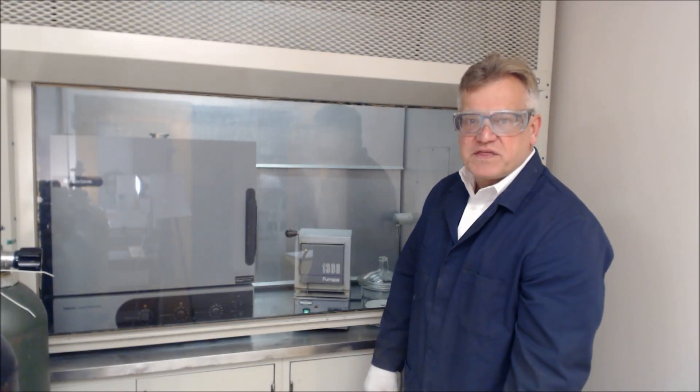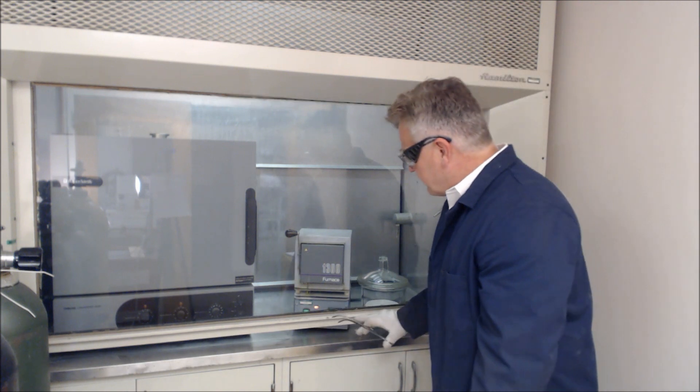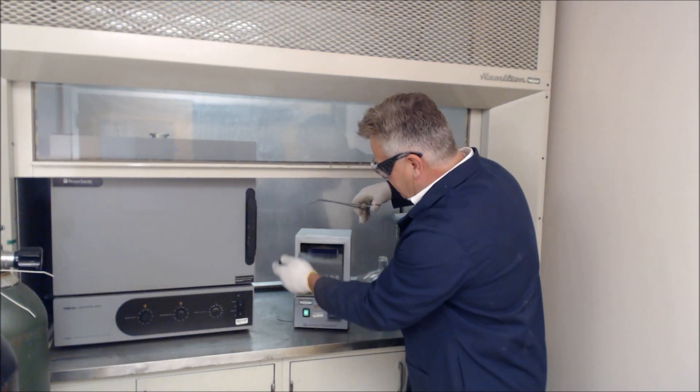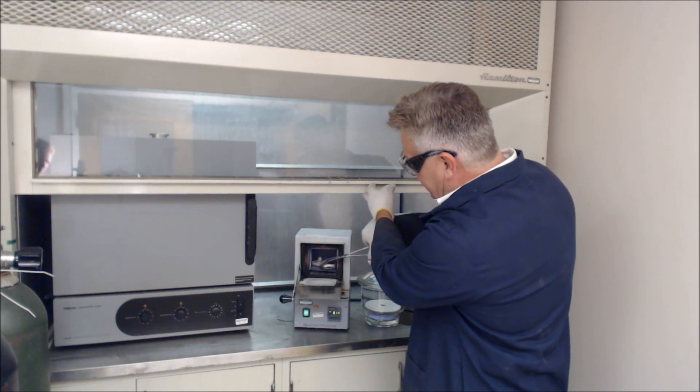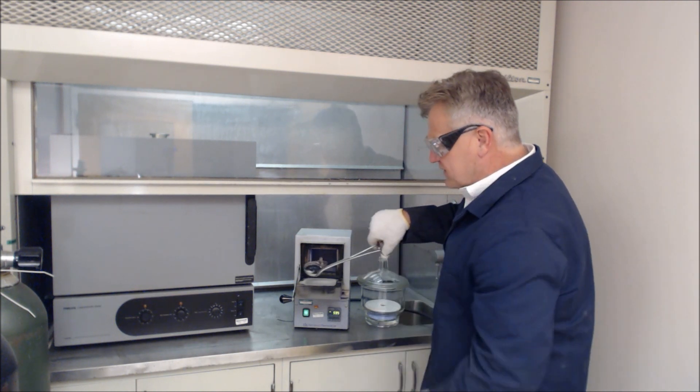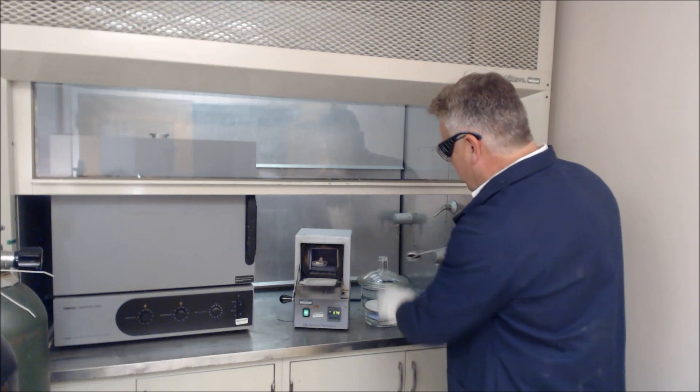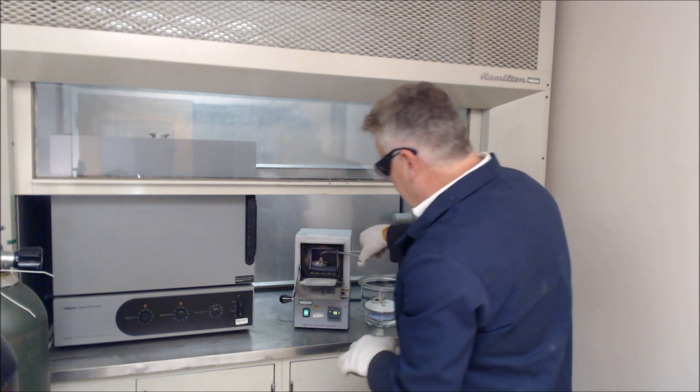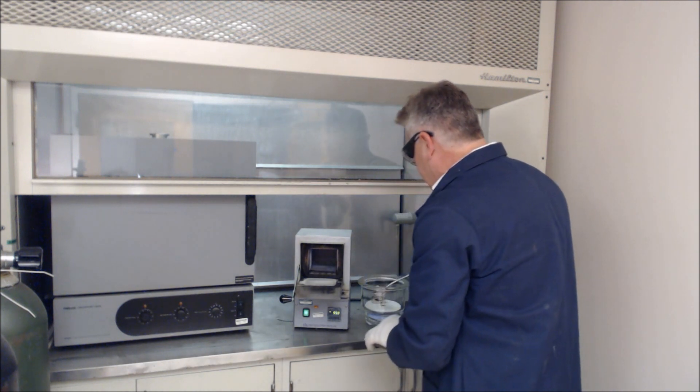We've waited now for the three minutes of the burn and we have to subsequently retrieve the specimens. We do that by opening up the fume hood and subsequently opening up the furnace. The material now, which started out as a membrane, has disintegrated to the point where these materials are just powder. We now have to place the specimens in the desiccator and wait two minutes for them to equilibrate as far as temperature is concerned.